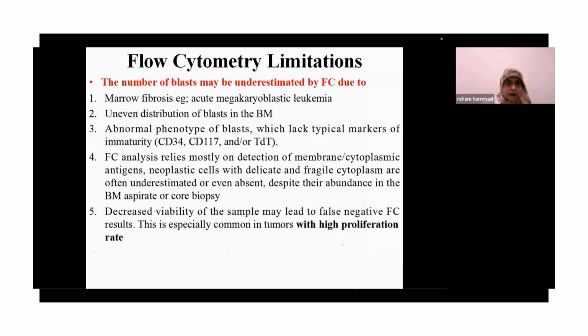Do we have some kind of limitations in the flow cytometry? Yes, we do. Sometimes the number of blasts you are looking for is underestimated by the flow cytometry, and you have to be very honest with yourself. Yes, you do have many, many limitations.